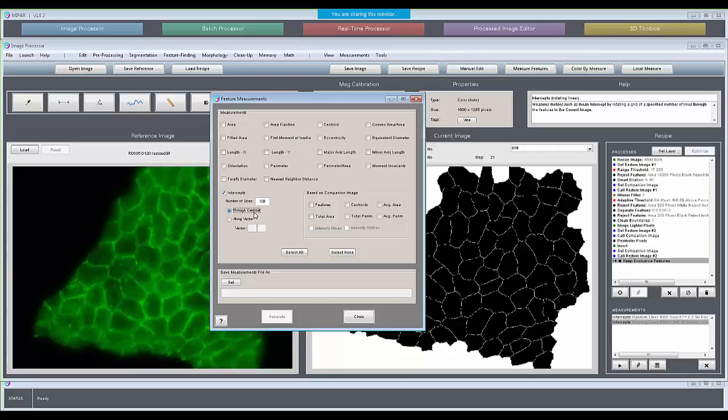So this could be thought of as a more advanced diameter measurement than just equivalent diameter. Equivalent diameter gives you the diameter of each feature if that feature was a circle of the same area. And that works well for circular-ish shapes, but if you want to measure the diameter of an elongated feature, boiling down an elongated feature's size to a single scalar starts to lose meaning anyway.